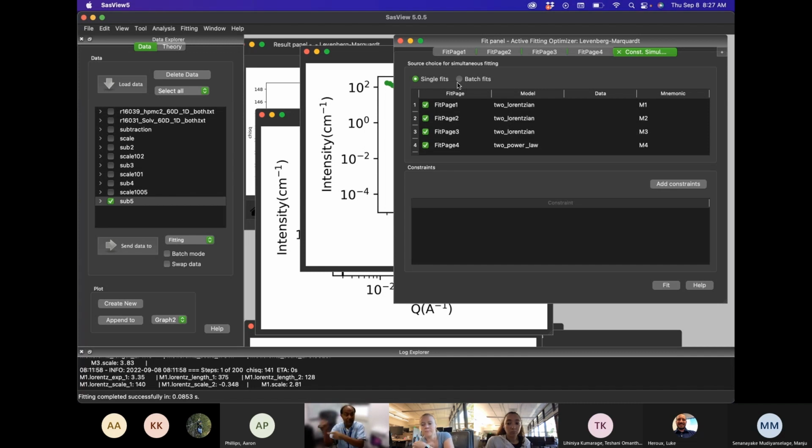You should make it point to that radius. So they have become fixed to the radius of 100%, let's say. And if the thickness is also not changing, that also should be there. Now, the SLD of your core is fixed. SLD of the solvent is varying. SLD of your shell will vary, because it should vary based on the amount of solvent. Then your fits may not be as good, but at least your comparison from one to the other, you feel more comfortable because then you can see a trend.